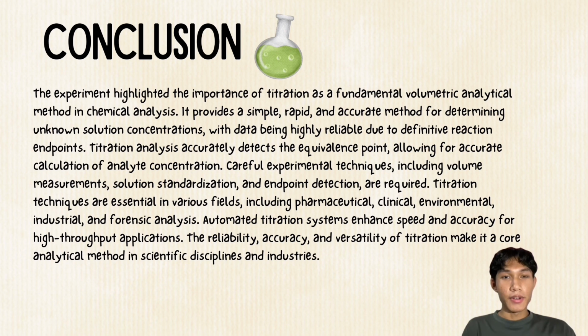Titration analysis accurately detects the equivalence point, allowing concentration calculation. Careful experimental technique including volume measurements and standardization ensures reproducible results. The experiment underscored the significance of titration as a fundamental analytical technique in chemistry, highlighting its reliability, accuracy, and versatility in various scientific disciplines and industries.